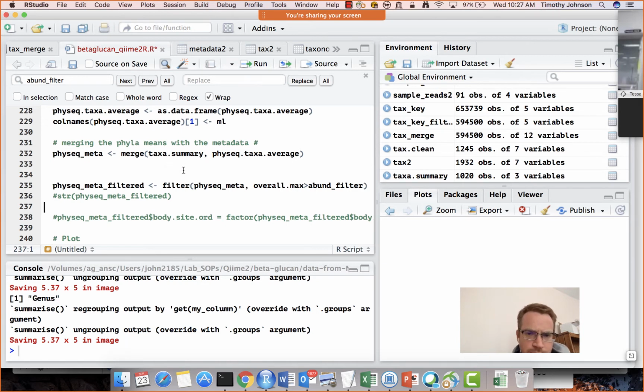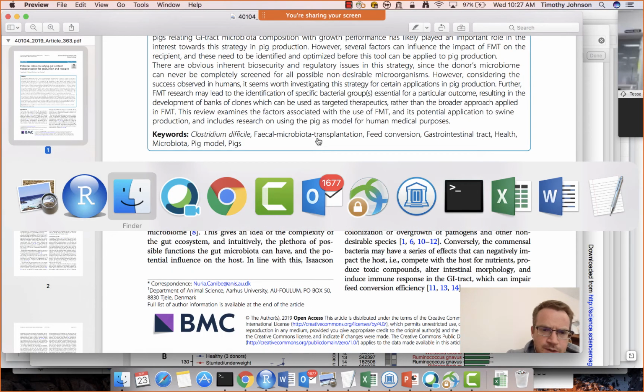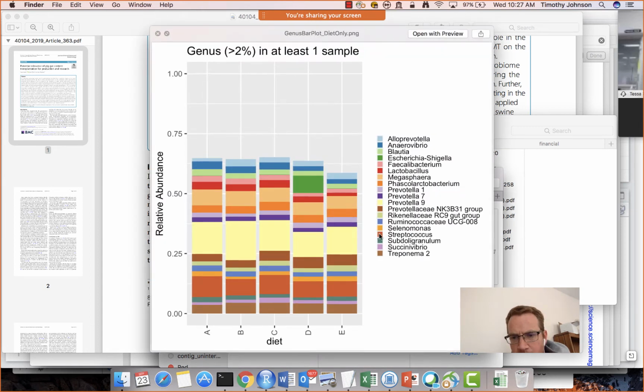Okay, so that was pretty successful. Let's see, did any of the unclassified things make it into our graph?